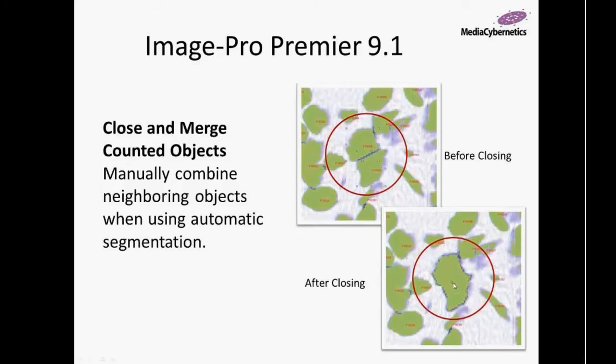Again, there's the reverse of this where we can actually do some object splitting. Instead of having to do a manual split, we can do it automatically, and there are parameters to make this more automated. This will work only on whatever objects you select, again, coming from the Measure ribbon.